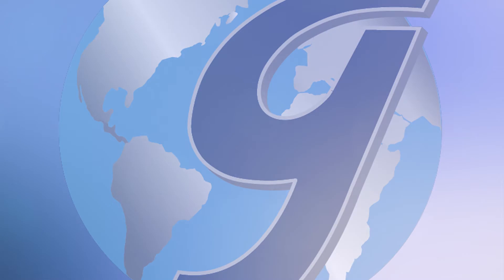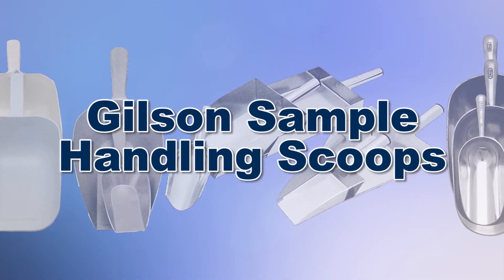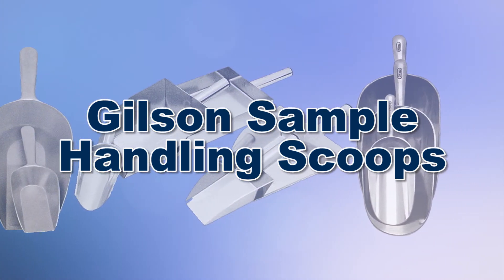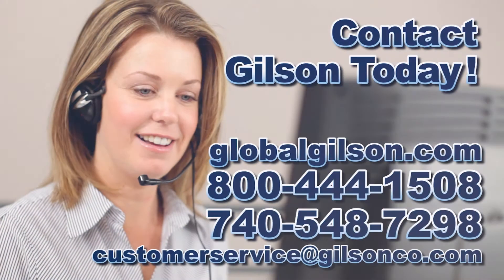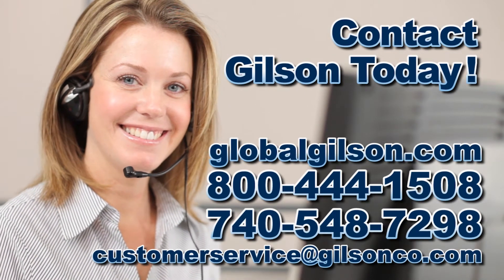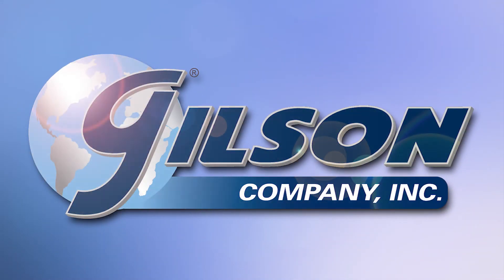With Gilson's complete selection of scoops offering a wide range of features and capacities, Gilson has the right scoop for your sample handling needs. Be sure to check out these and all our products listed in the Gilson catalog and on the Gilson website. Gilson — your industry leader for materials testing equipment.